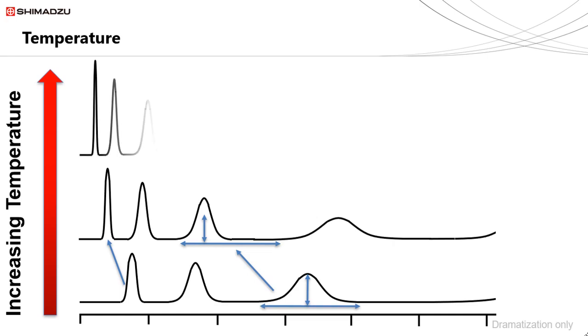As we increase the temperature further still, these changes increase yet again, to leave our final chromatogram at the highest temperature having 6 compounds eluting within the same amount of time as our initial 3 components.